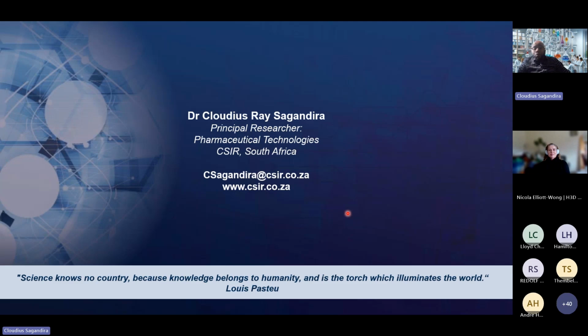Indeed, it's quite unfortunate that this technology is mainly driven by chemists. But one thing I saw is that in Europe and the USA, there are engineers that actually do continuous flow technology, so they are well equipped to do this type of work. In terms of sizing up, what people usually do is go for commercial equipment. So if you buy a lab scale equipment from Chemtrix where you're working at microliter scale, then when you need to size up to production scale, you need to buy a Chemtrix, for example, at that scale. Then you don't need a lot of engineering anyway.